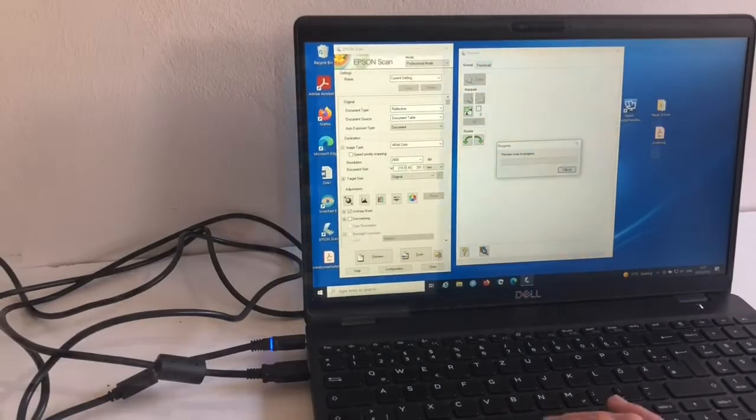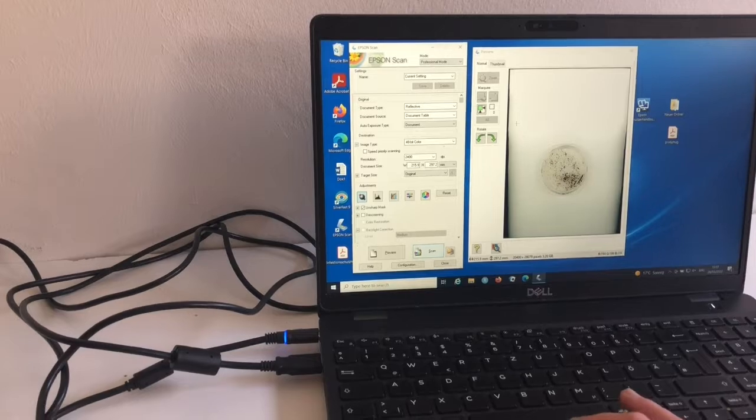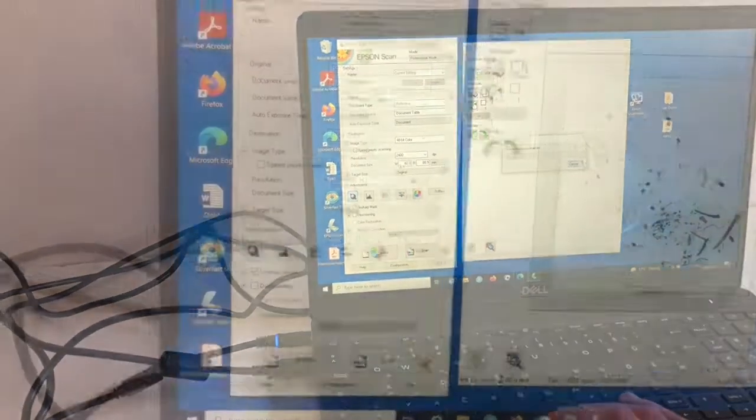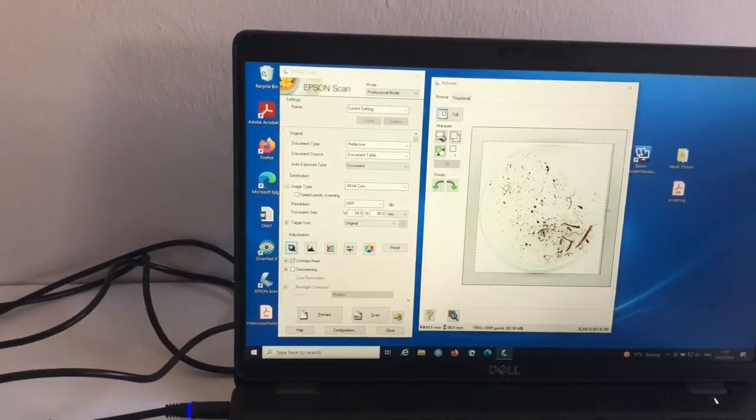Here an example of Epson's scanner software is shown. We run a preview and set the scanning frame perfectly matching the dish size.